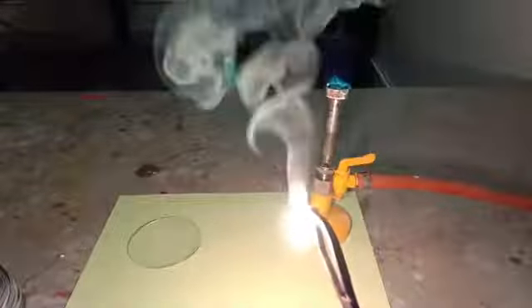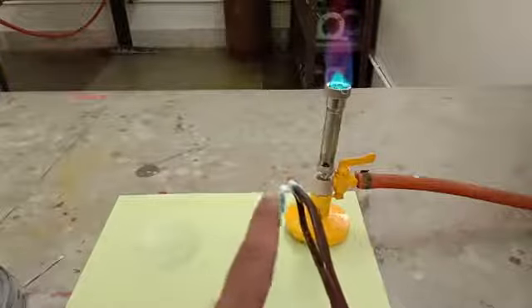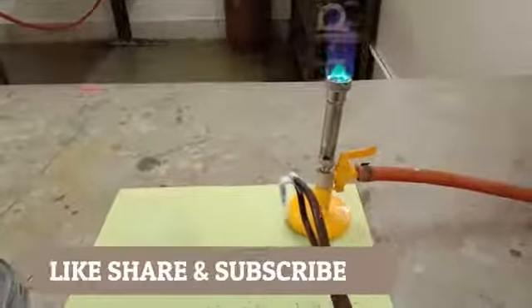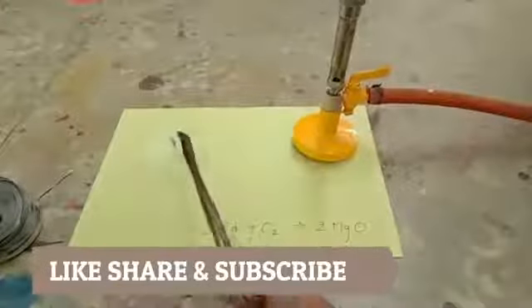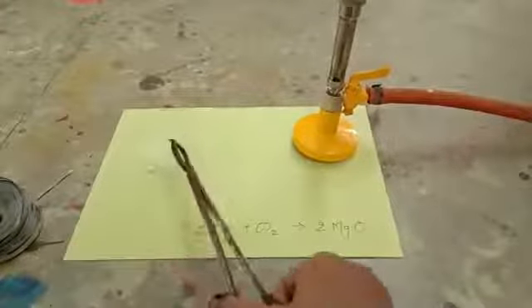As you can see that magnesium burns with a dazzling white flame. Now as the reaction is completed you can see that this white color thing is being produced. This white color is nothing but magnesium oxide.